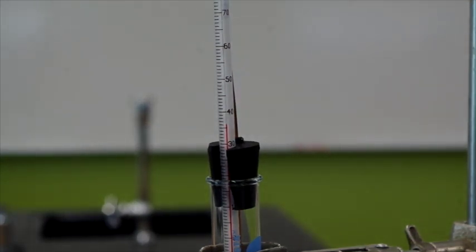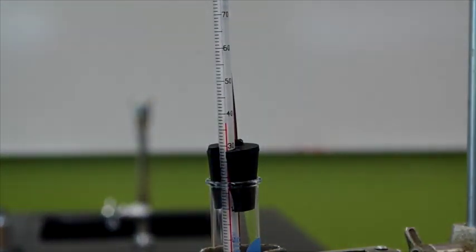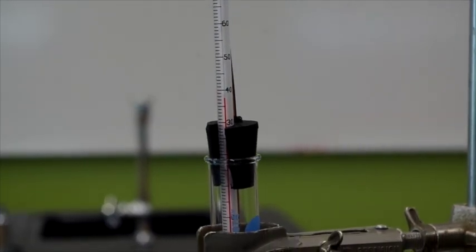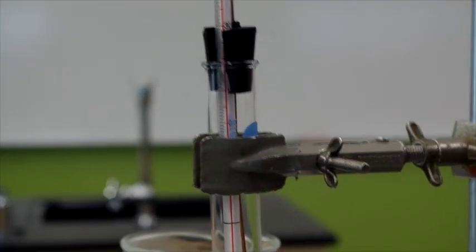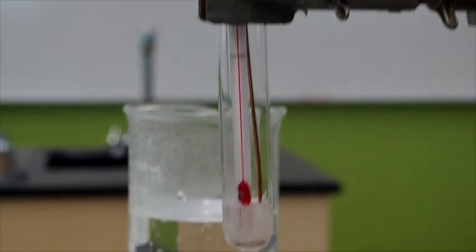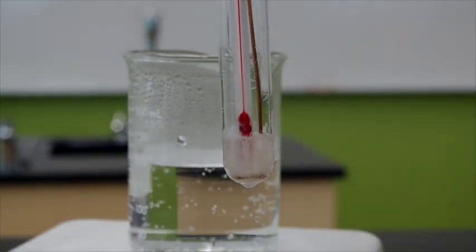Would you like me to go down to it? Yeah, you can start. Let me get this last measurement and then you can go down to it. Okay. We're at 37 and a half. Can no longer stir it because the thing is frozen in place.